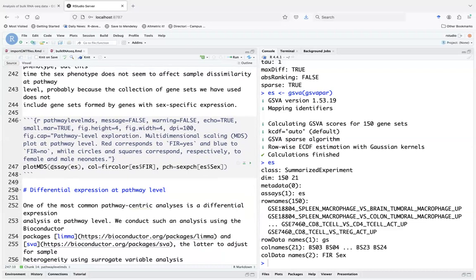So maybe I want to ask a question. You showed that using the readGMT function, you can read gene sets as a list. So what if you already have a list in that format? You can use it. Can you convert it into a gene set collection? We don't do that conversion. Currently, there's no function for that. You can directly use such a list, or you can use a gene set collection. Both are possible, but gene ID conversion only works with gene set collections.